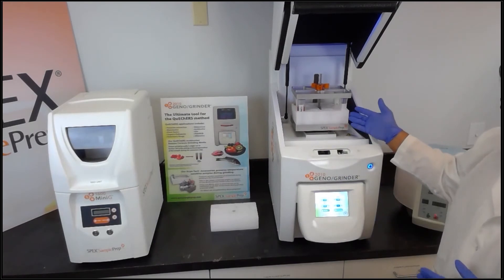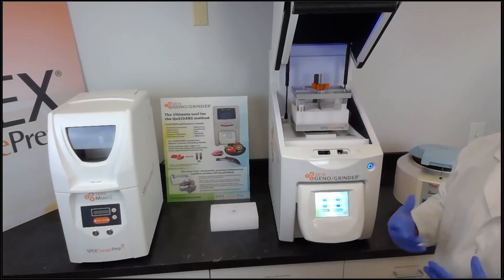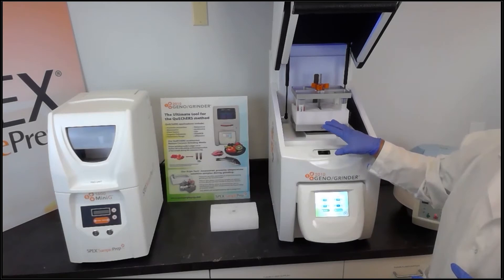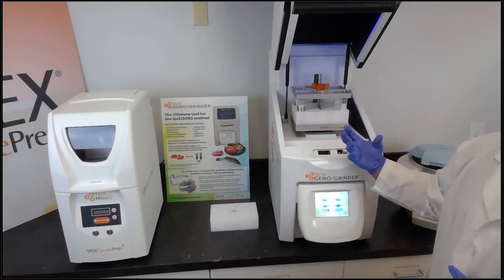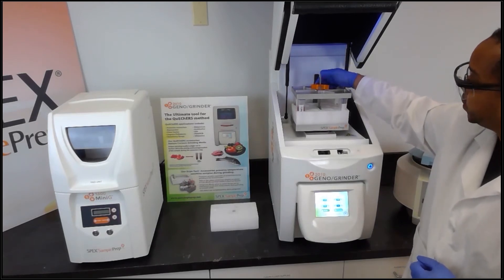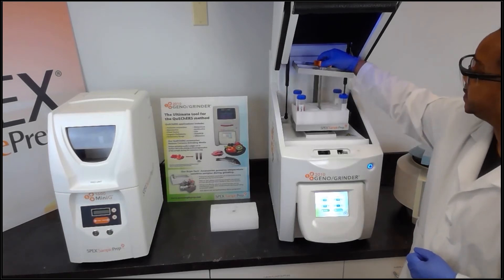In this case we used one minute to process strawberries, apples, and kiwi. If you're working with other fruit that may be more fibrous, or vegetables that are more difficult to grind, you can increase the runtime in order to pull more of the pesticide extractions out. To remove the samples, simply give the knob a few turns, depress the quick release button, and slide the clamp lid off.